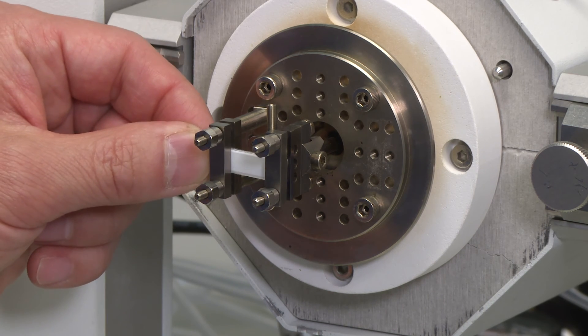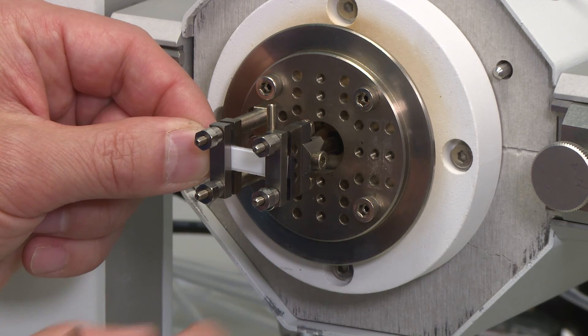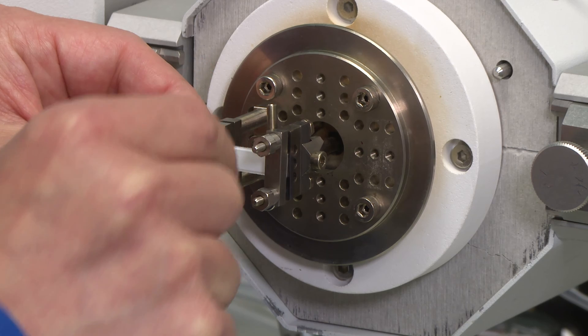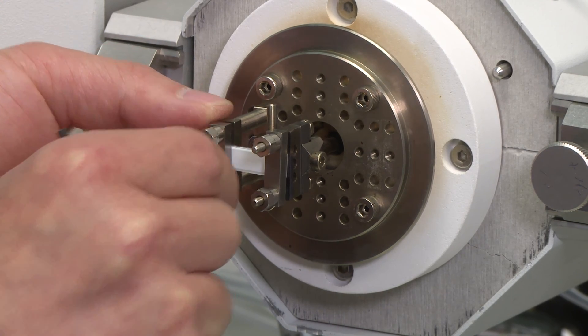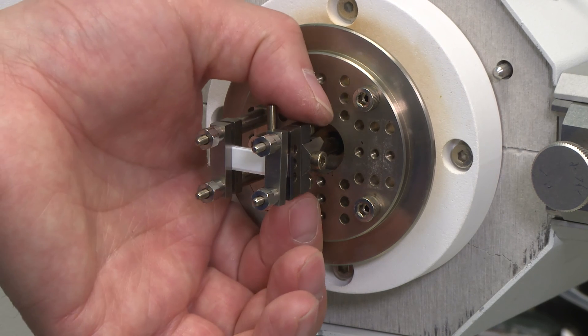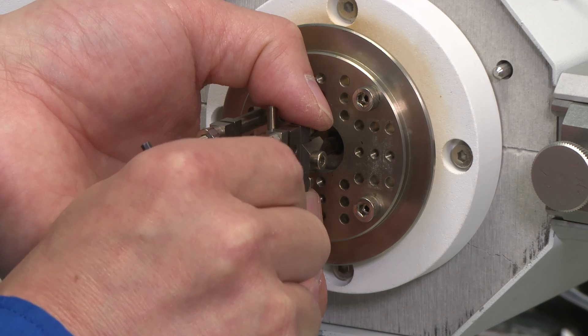After you have set up the single cantilever bending fixtures, you can slide in your sample and tighten. Usually you want to tighten the nuts on the fixed pillar and hold the drive shaft while tightening the other nuts.